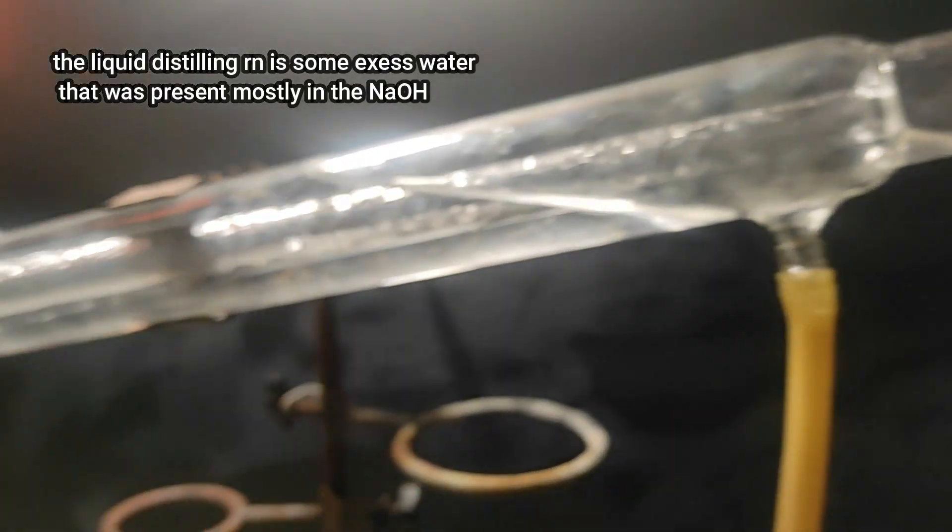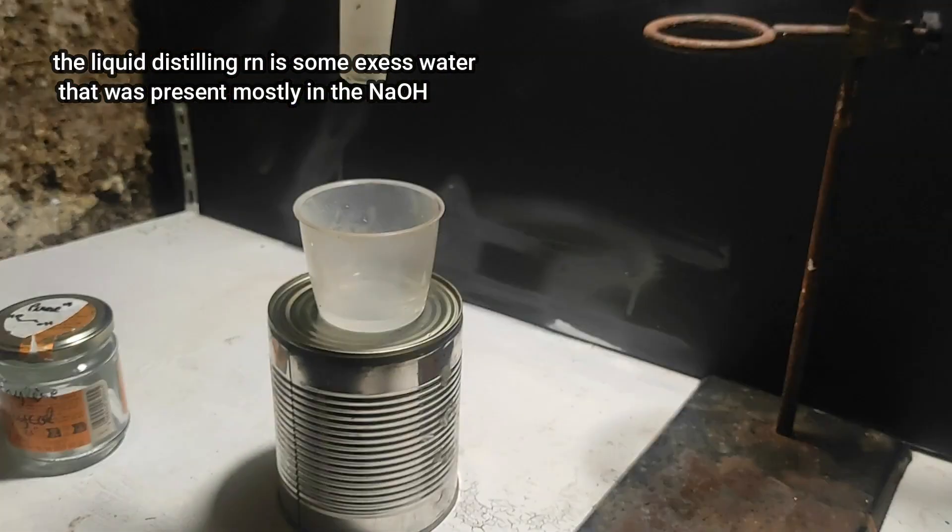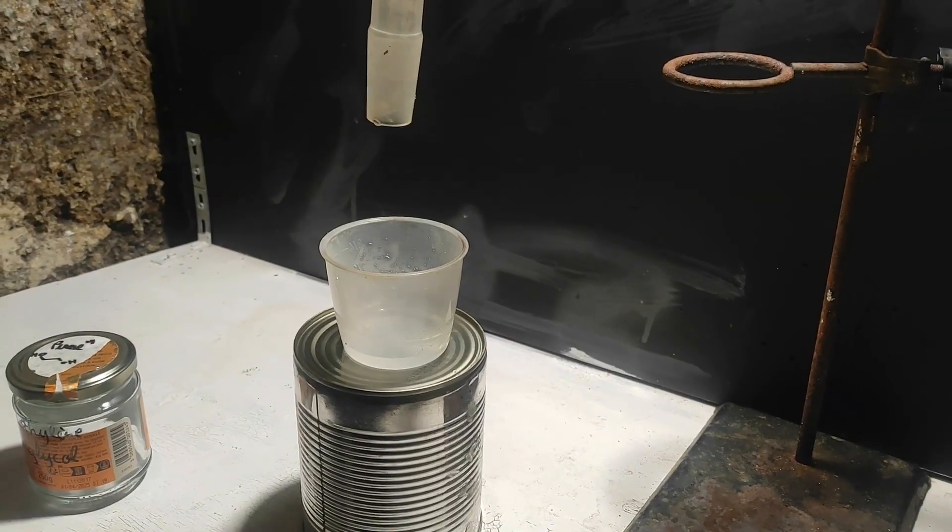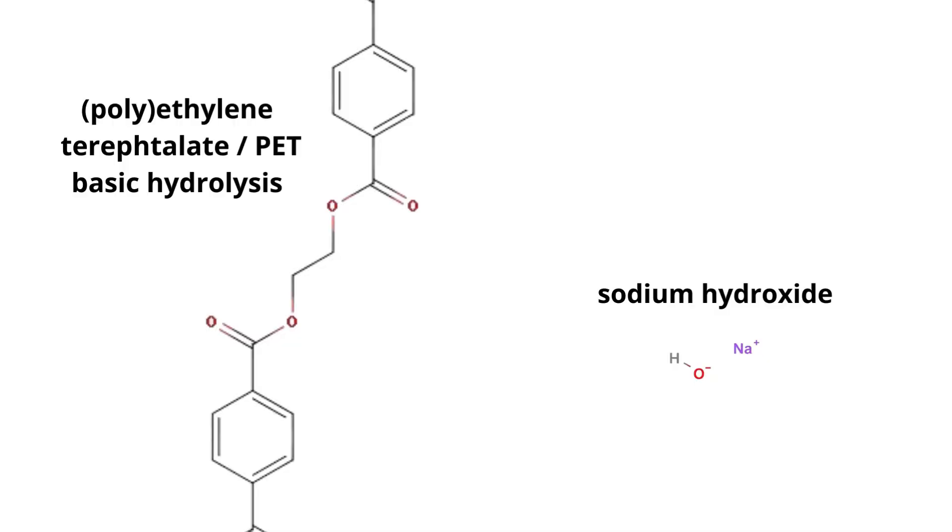So regardless, we keep the reflux for multiple hours, and while this is going, let me explain what is happening in the reaction. Here is a piece of the PET polymer, and as you can see, it's made out of terephthalate diesters with ethylene units. And in this reaction, we will break the ester bonds.